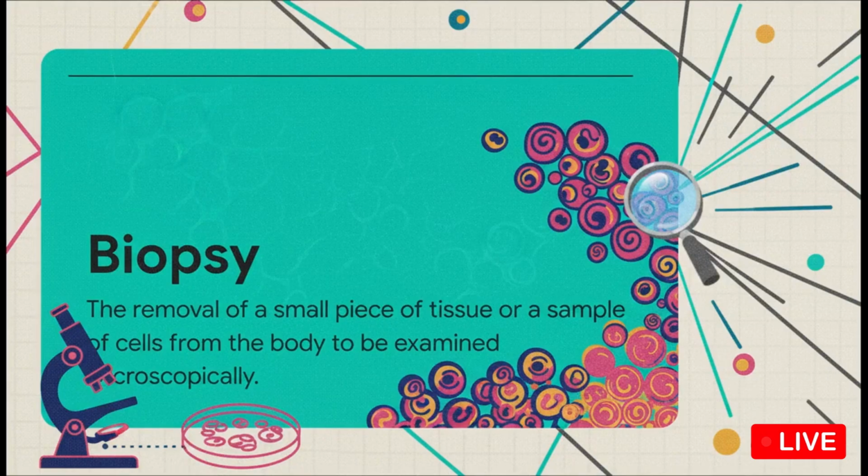So, what is a biopsy, really? At its core, it's a pretty straightforward but incredibly powerful idea. A doctor takes a small piece of tissue, or sometimes just a few cells, from the body. That sample gets sent to the lab, where it's put under a microscope. That one step gives the definitive answer for so many diseases, from cancer to skin rashes. It's literally the bridge between just suspecting something is wrong and getting a certain diagnosis.